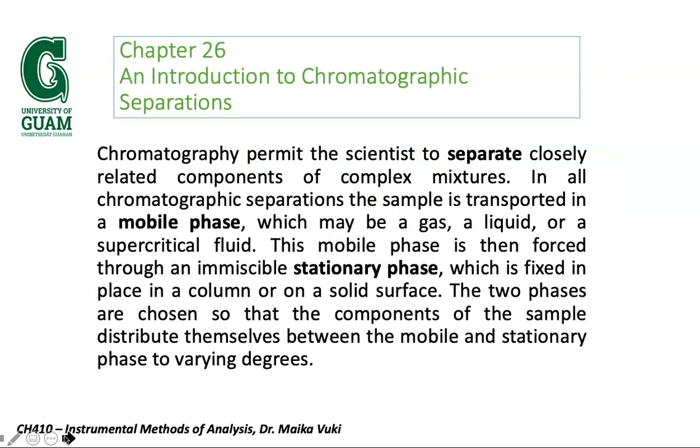So what is chromatography? Chromatography is a process used for separation. Chromatography permits the separation of closely related compounds of complex mixtures. In chromatographic separations, the samples are transported in a mobile phase and allowed to interact with the stationary phase.